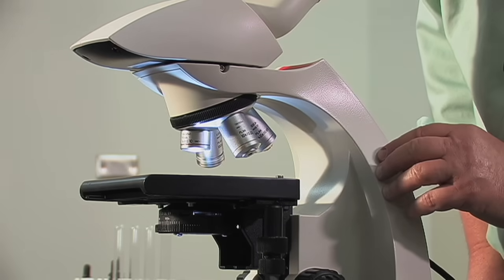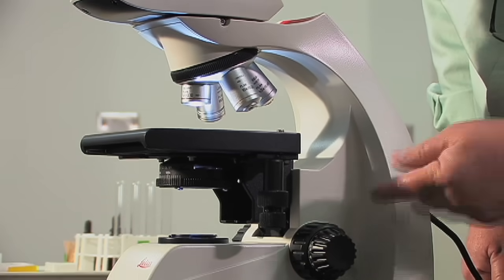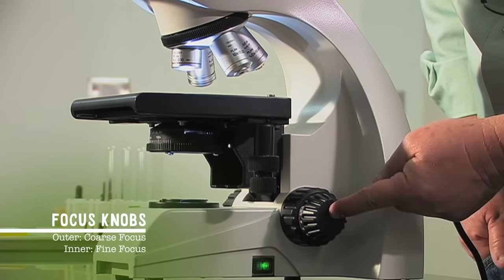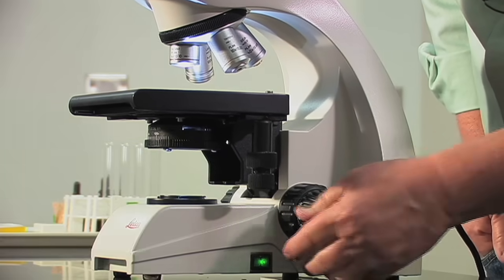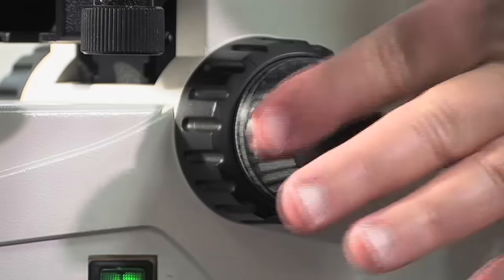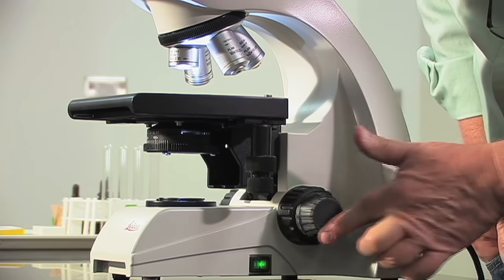To focus the image in our microscope, there are two focusing knobs. The one on the outside is called the coarse focus knob. The one on the inside is called the fine focus knob. You'll notice that when I move the coarse focus knob, the stage moves a lot. When I turn the fine focus knob, it moves in very small increments.